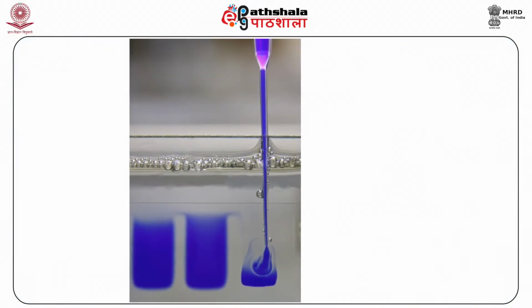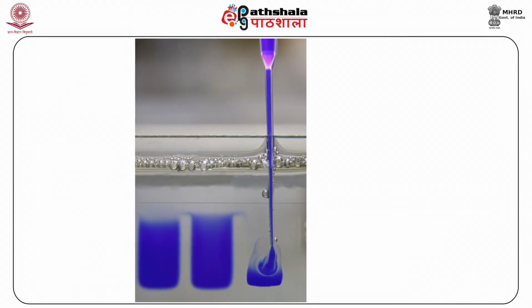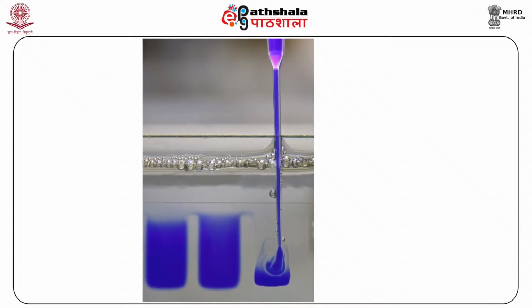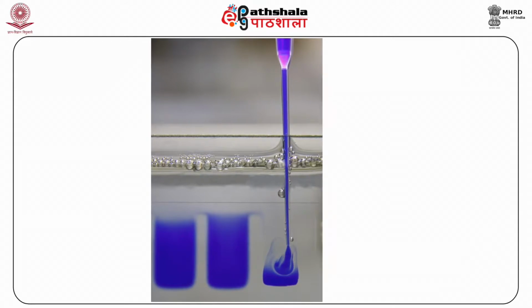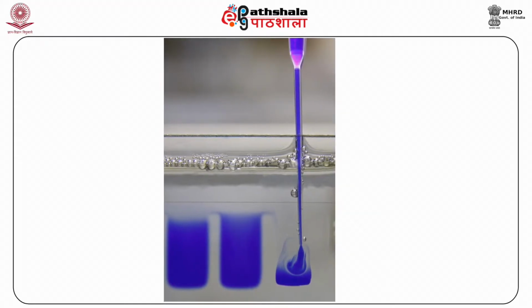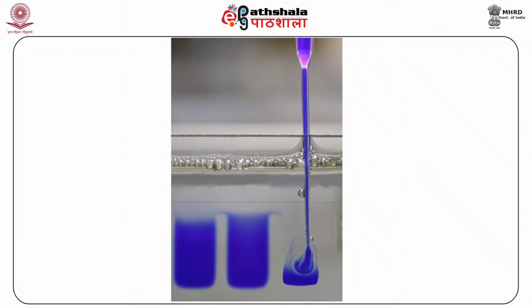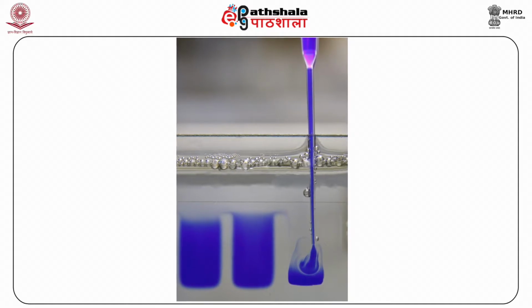Polyacrylamide gels. These gels are comparatively tougher as compared to agarose gels. This gel forms when a mixed solution of acrylamide and cross-linker monomer copolymerize into long chains that are covalently cross-linked. The cross-linker holds the gel structure together. This polymerization of acrylamide is a free radical catalyzed reaction. Preparing these gels is a more complex process.